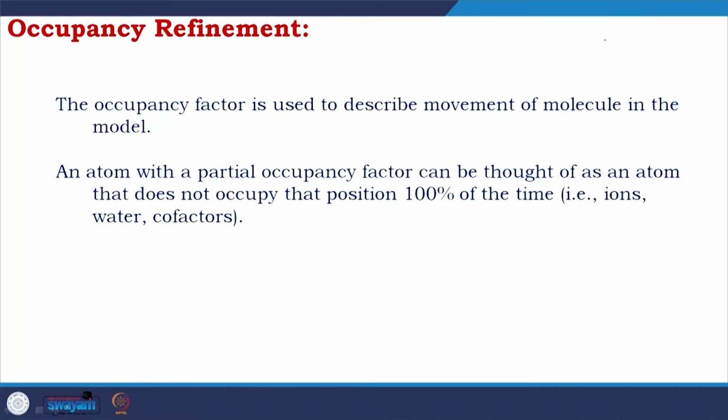Up to now I was talking about the X-ray structure providing you a very static model, but considering occupancy you could see the alternative conformation. That means you could map the movement of the atoms, though the overall result in the PDB is a static structure.